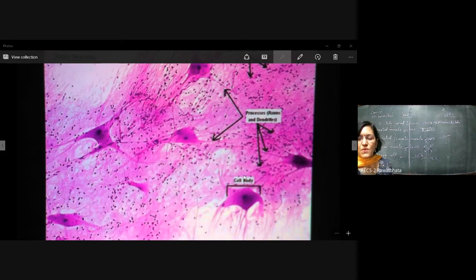So if you observe very carefully, the connections are very clear in this case, 1, 2, 3, 4 and 5. The way they are connected, the tail of one, or the nerve ending is a proper term, of one connects with the head of the other. For example, these arrow marks, look at this one. One process coming from this particular one connects with, here this particular cell has its dendrites going up.